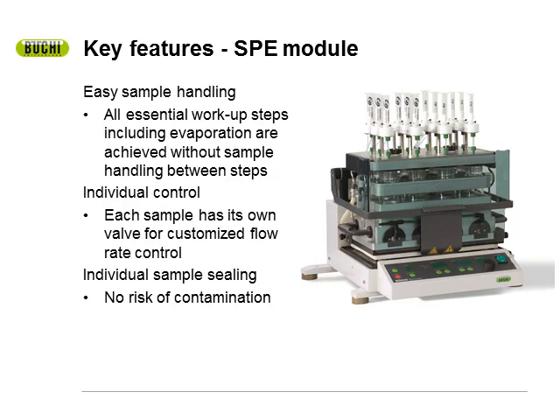Like I mentioned earlier in the webinar, the Syncore is capable of solid phase extraction. The SPE module will actually fit right on top of the vessels themselves. This means that all the workup steps involved with the solid phase extraction are all done without you having to move any of the glass vessels. For instance, you can elute the sample to the glass vessel, you can flow it to the waste vessel, to the drain vessel, and then you can even do your evaporation step without moving any of the glass vessels. All you simply do is turn the valve, which is on each one of those cartridges on top.